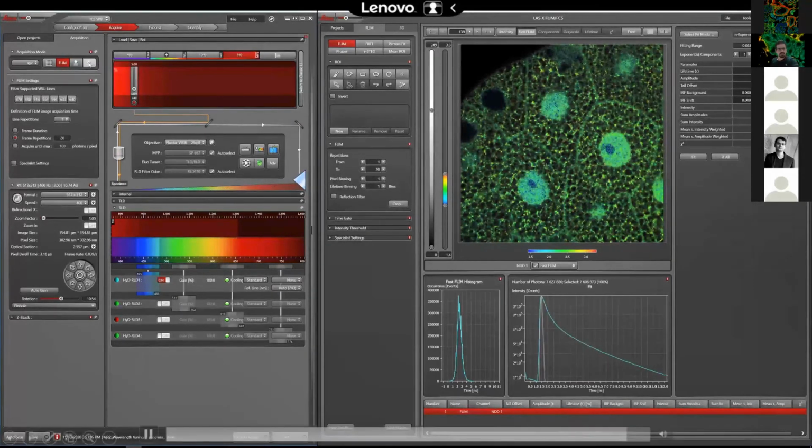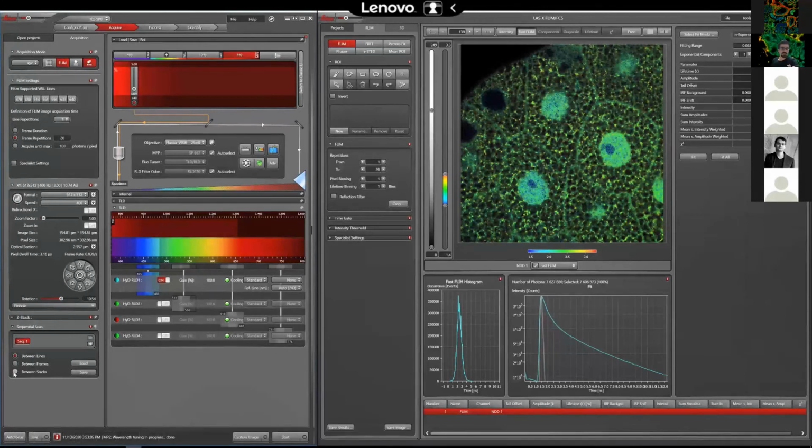And then we need to check for the sequential imaging. So what is important here, so far I was talking about the NADH only. The second part is FAD. FAD was not our main focus. We just did it as a bonus. It's a very tricky experiment to do.